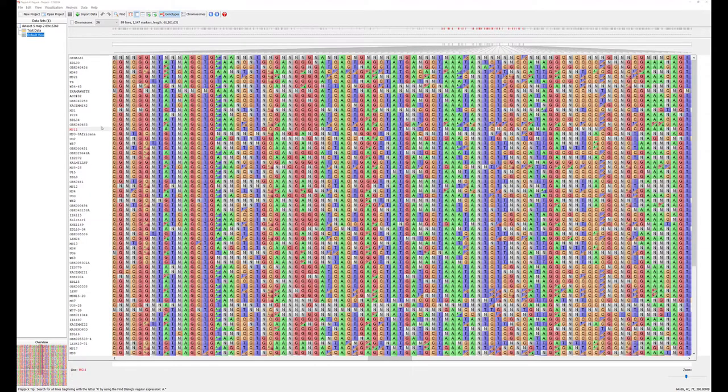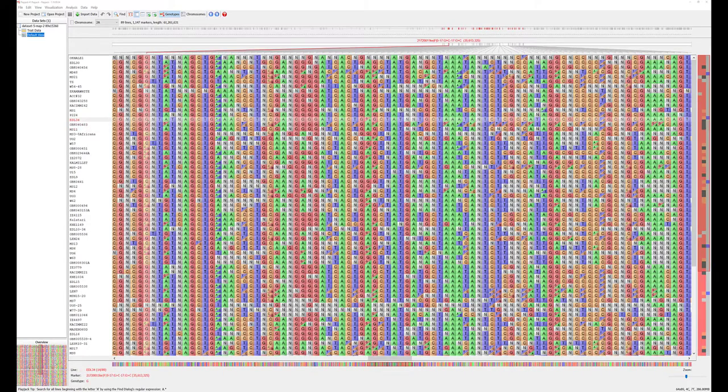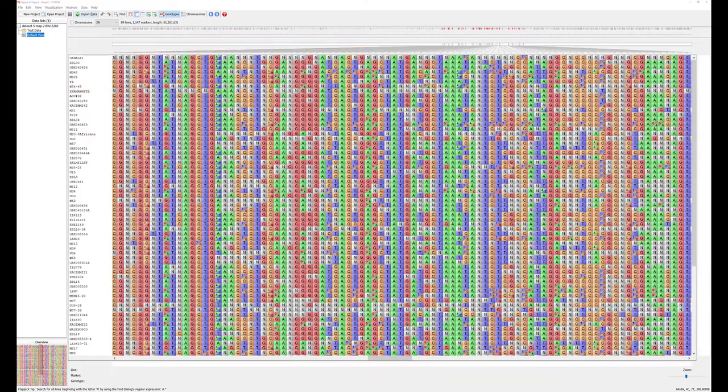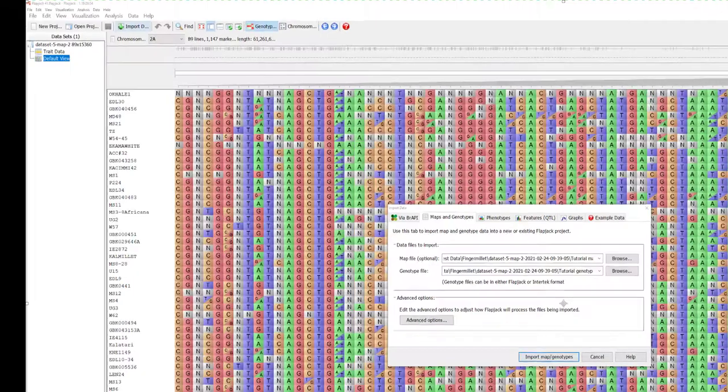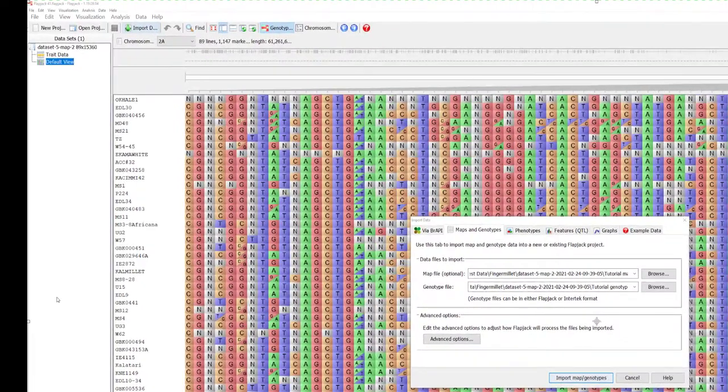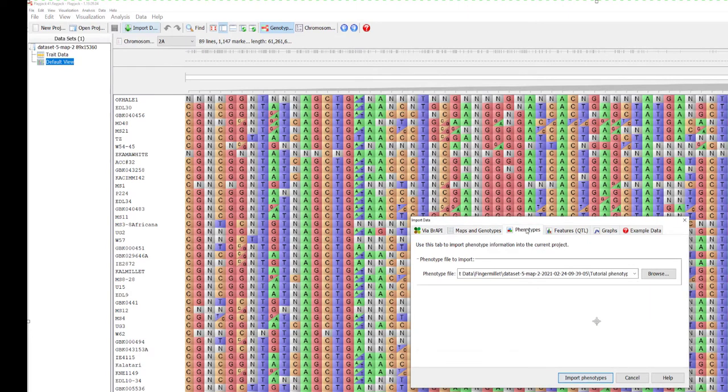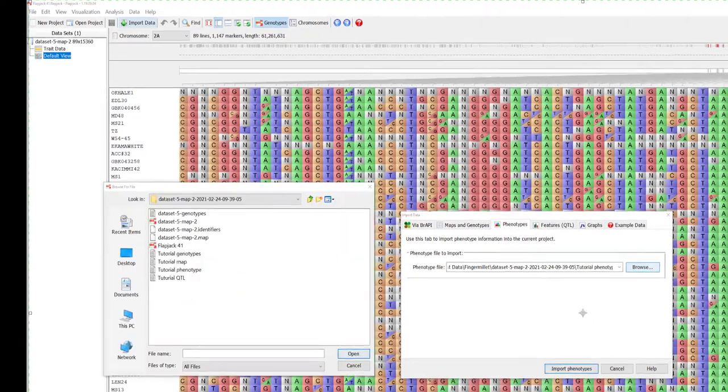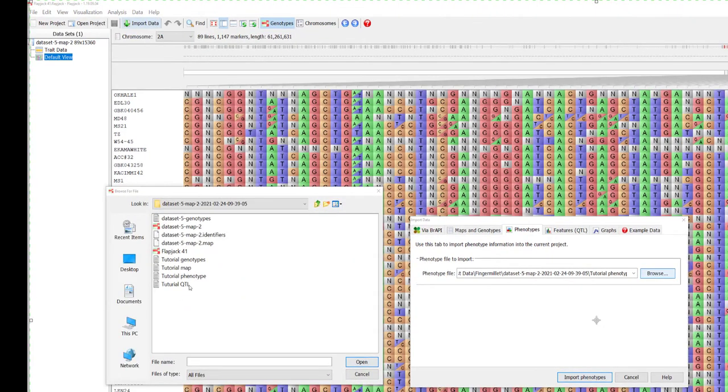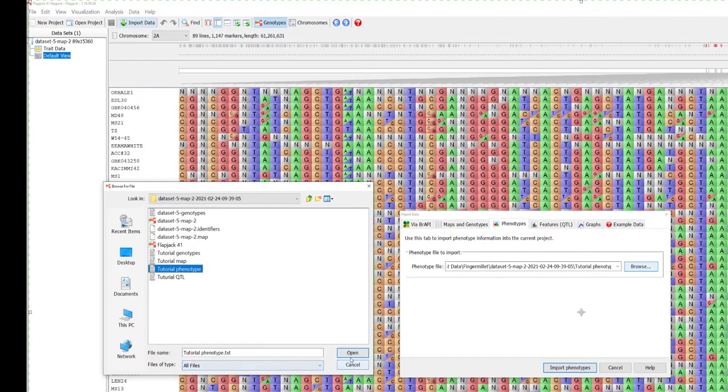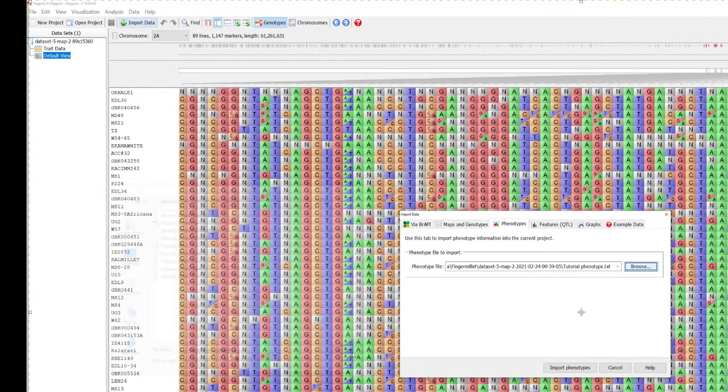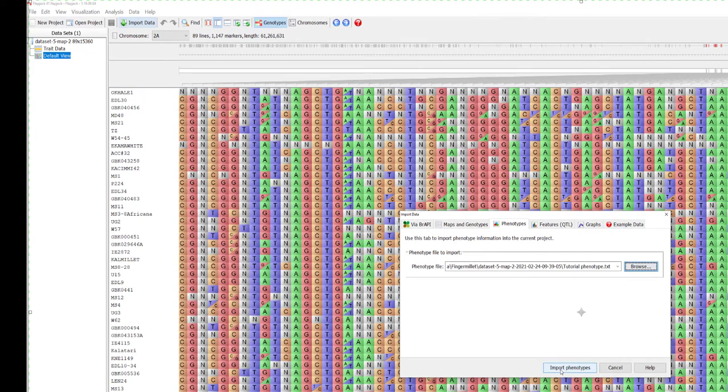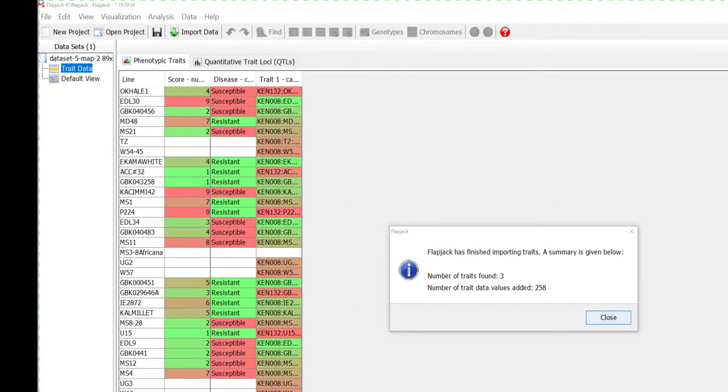Let's look at other importing options. To import phenotype information, again use the import data options available. Browse and select the appropriate file and click import.